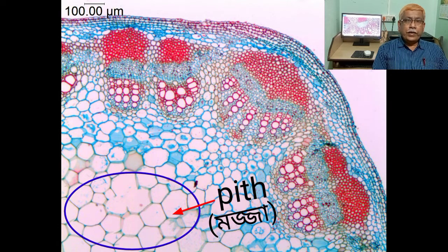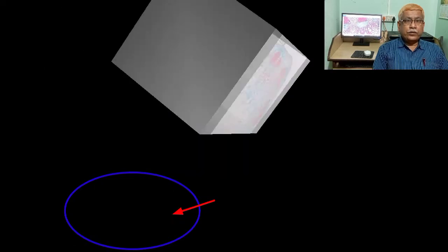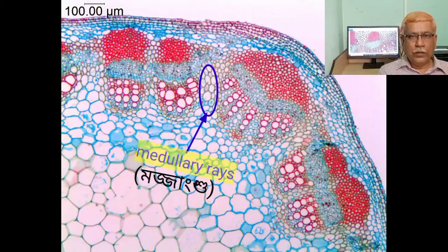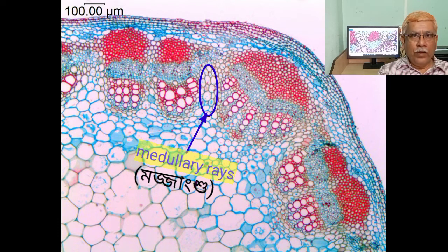Pith has parenchymatous cells with intercellular spaces. It helps in the storage of food materials. The strips of parenchymatous cells found between vascular bundles are called medullary rays.